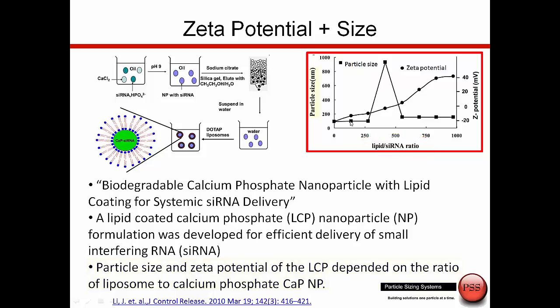Looking at particle size on the left — the square data — and zeta potential on the right, as we change the molar ratio, we see the zeta potential go from negative up to positive. It doesn't matter if the charge is negative or positive for stability — it's the magnitude of the charge that matters. So both extremes would be stable. But when the ratio reaches the point where zeta potential is essentially zero, there is aggregation and a very large increase in nanoparticle size, making it probably not as effective.